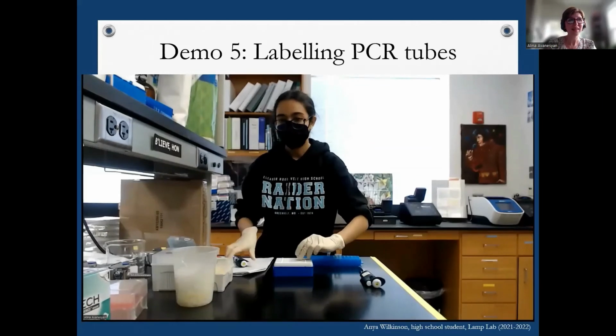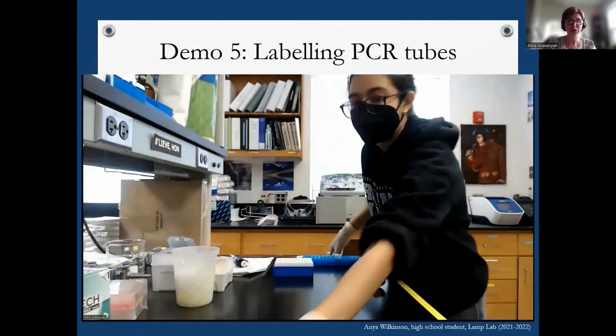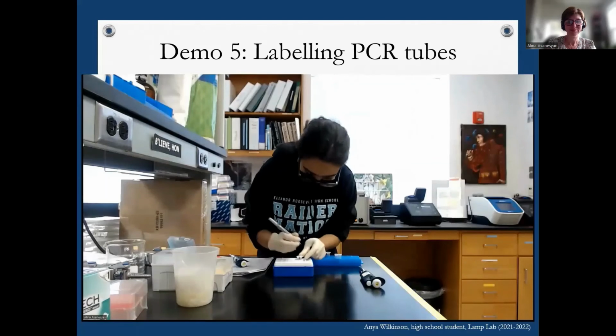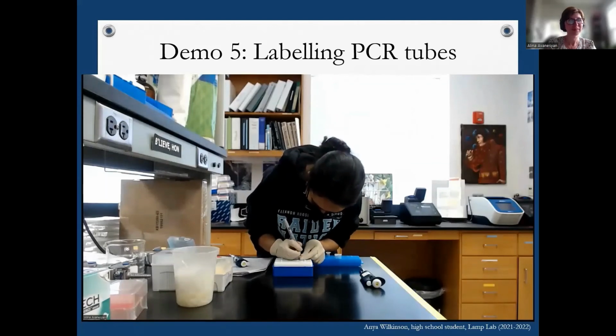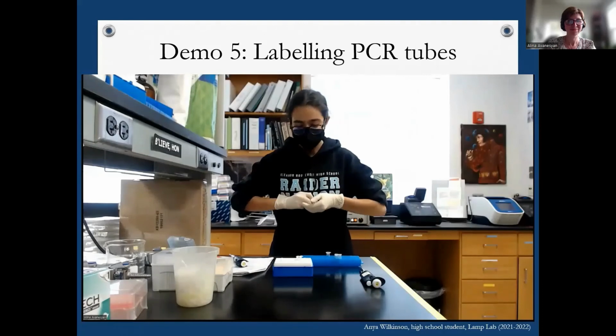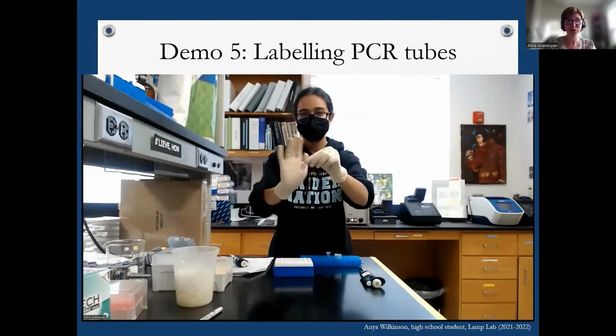Finally, you can see that we need to label the PCR tubes before you put them in the PCR machine. And they are now ready for PCR.